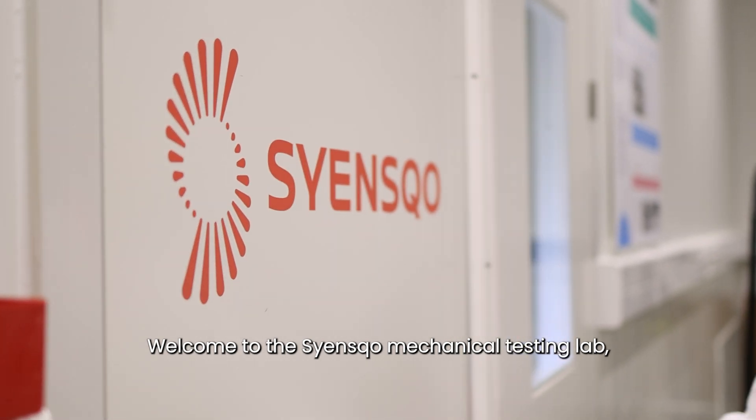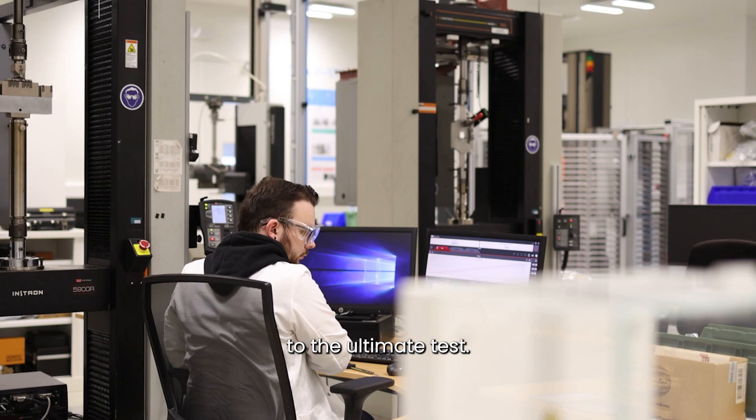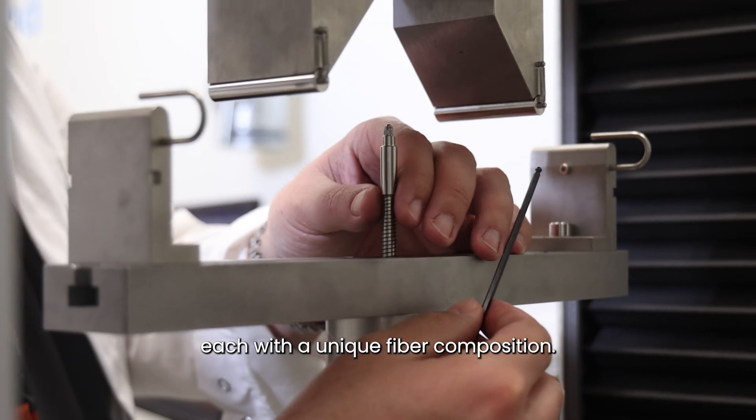Welcome to the ScienceCo Mechanical Testing Lab, where we push composites to the ultimate test. Today, we are conducting flexural tests on three composite plates, each with a unique fiber composition.